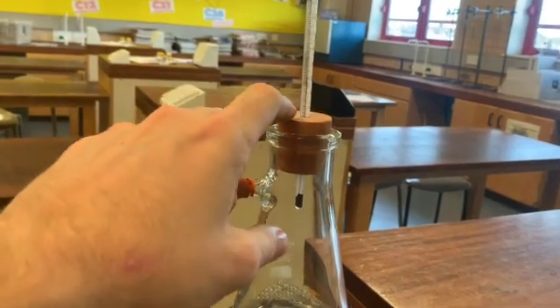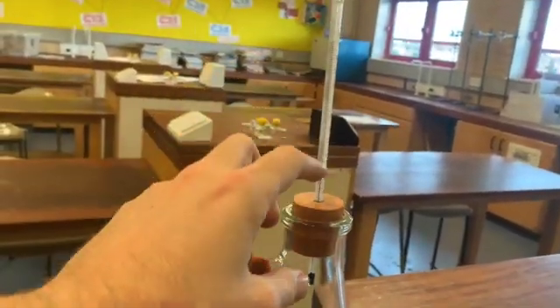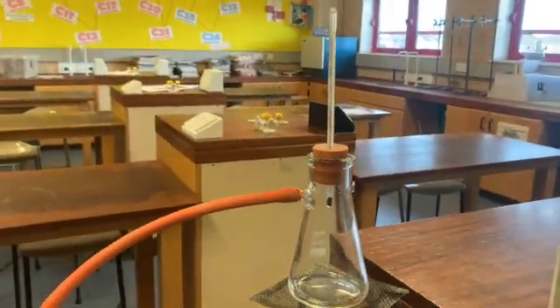I'm also going to set up a heating apparatus. Here I've got my Bunsen burner, my tripod and my gauze at the top, which will help heat the solution that's going to be in the flask. You'll notice in the neck of the flask I have a bung, and in the bung is a thermometer, which will enable us to keep track of what temperature it will get to.